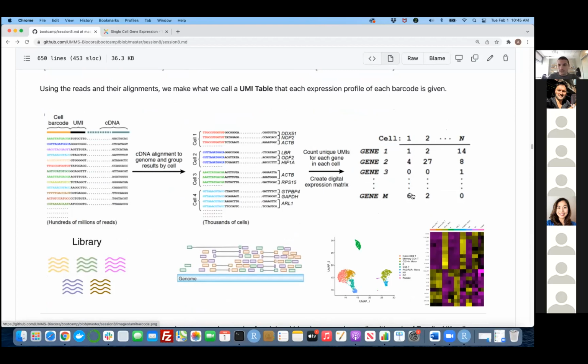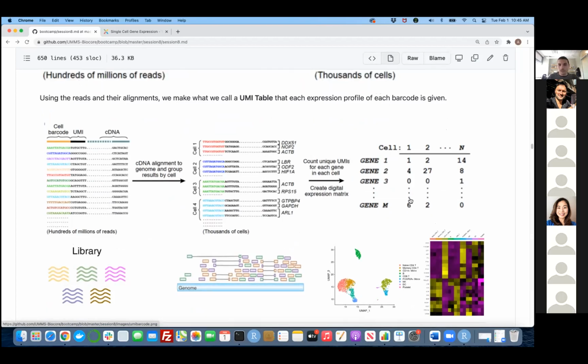Basically, some of these counts could be really small in total, which means that the number of RNA that you found in the expression profile is low, which will indicate that those beads were attached to some random cell-free RNA that didn't belong to any cell. That's actually not a cell, and we shouldn't be incorporating that into the analysis, so we're just going to remove them.